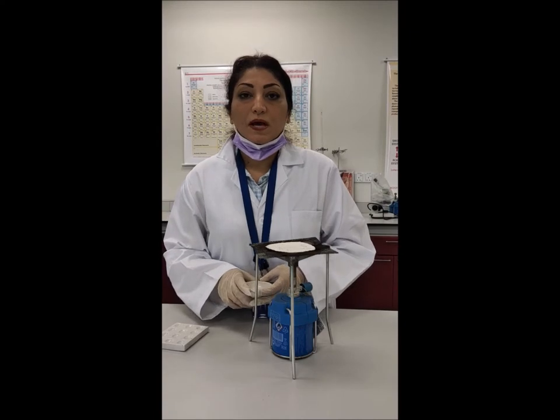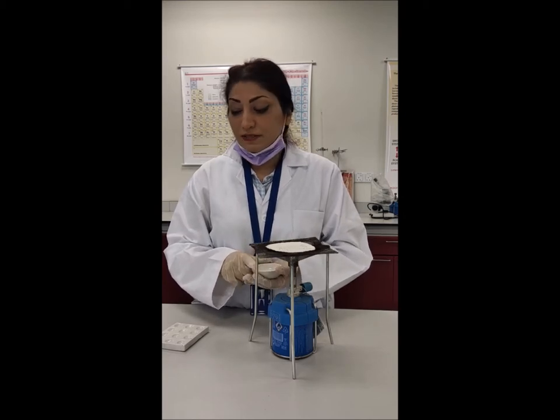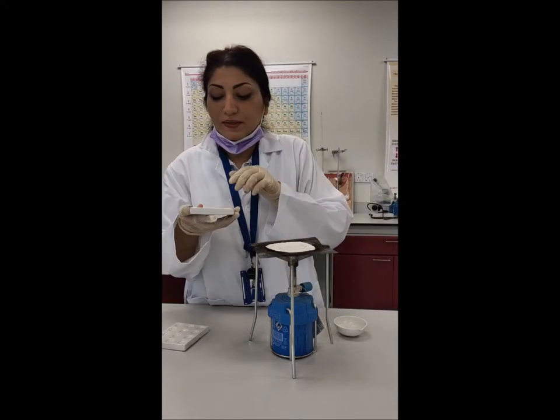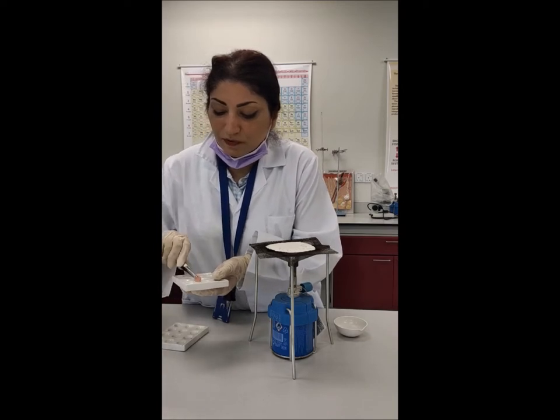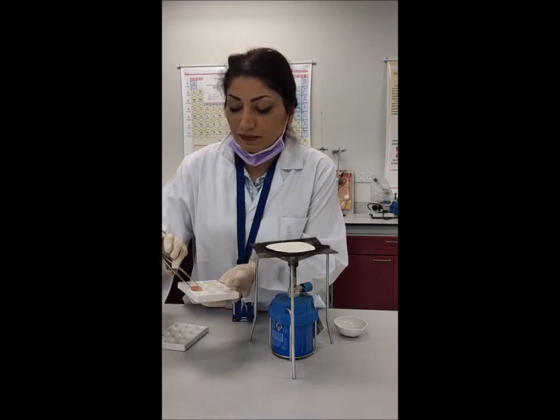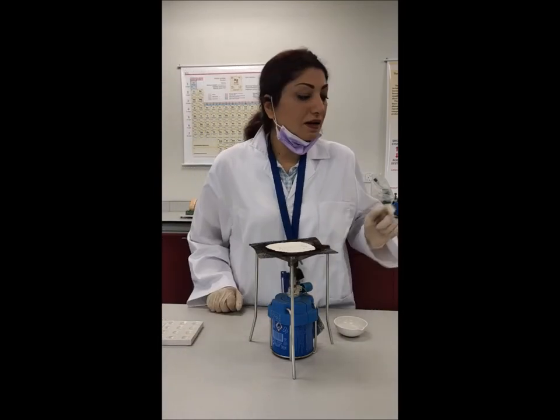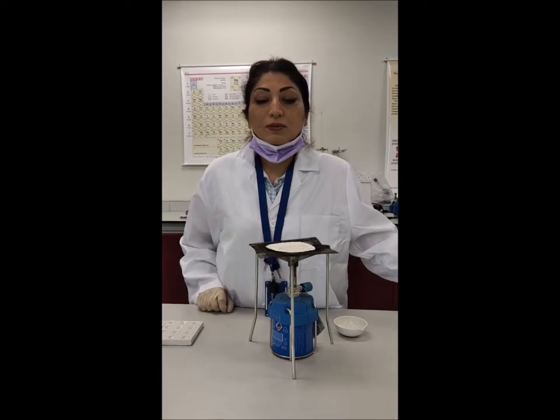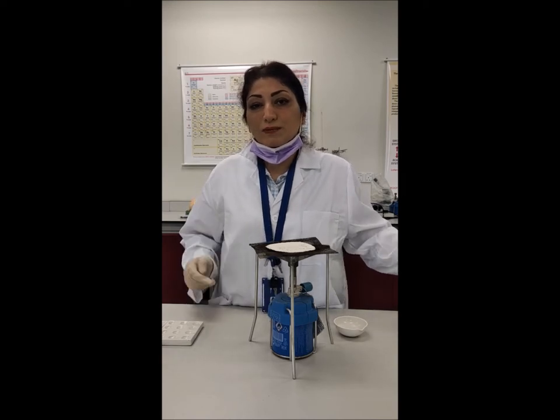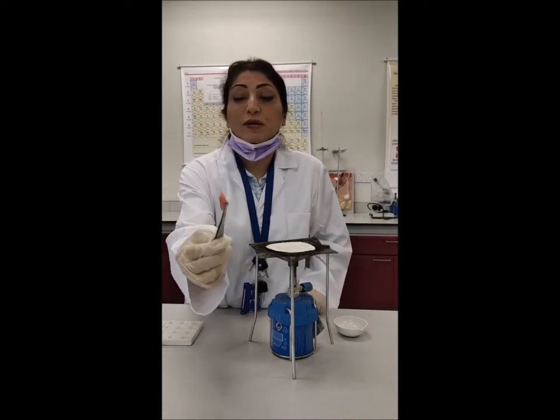My samples are actually animal cell samples. This is one slice of the tissue from the muscle of the meat of an animal — I just cut and placed it here. As you can see, the specimen of this tissue is quite thick.